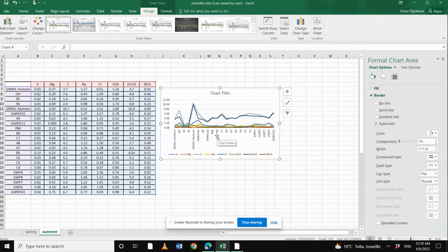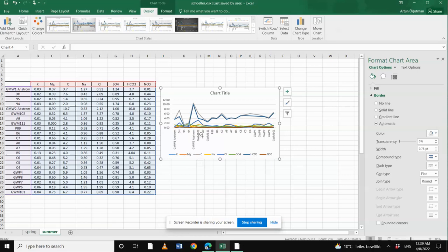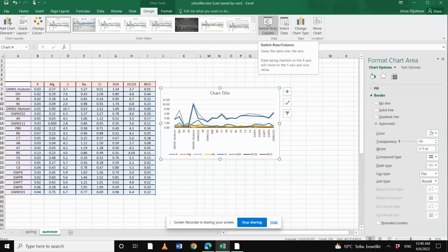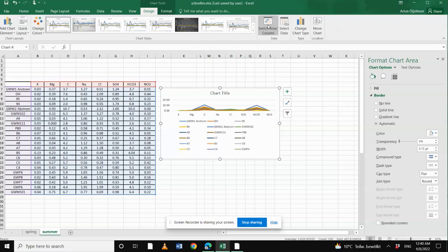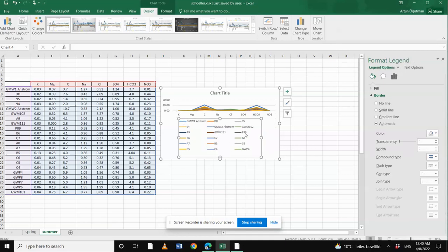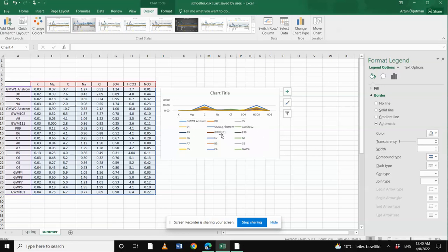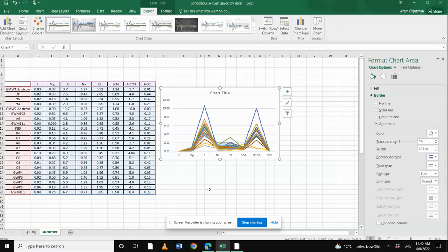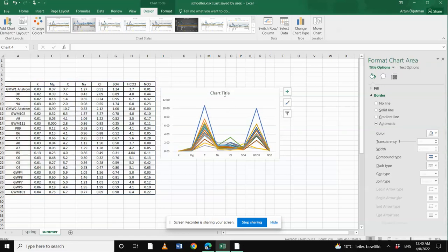At first glance, it looks quite weird. What we want to do is see the ion names on the x-axis rather than the sample codes or well names. We want to see the ions here. In order to switch this, come up here and click switch row and column. They are switched. We don't need these, I'll click and press delete. I'll also delete this one.